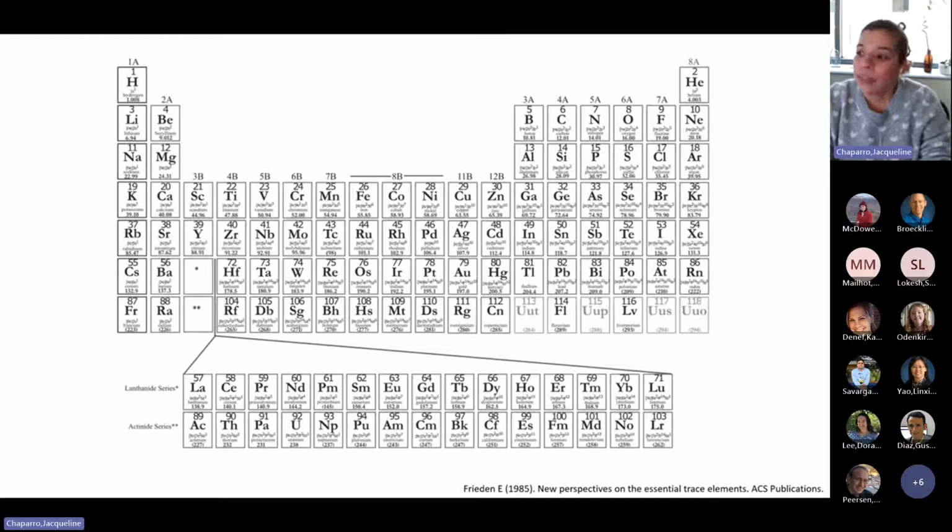And so, as I mentioned before, the ICP-MS is able to measure a multitude of different elements, found from high ppm all the way through ppt levels. And so we've been able to develop a method where we are able to analyze 26 elements, including internal standards, and in different modes for some of these elements to avoid known interferences. We have developed this, and you can use it for your samples as well.